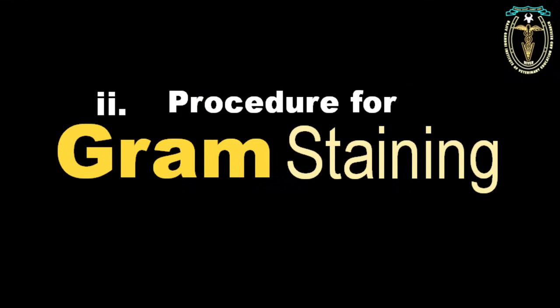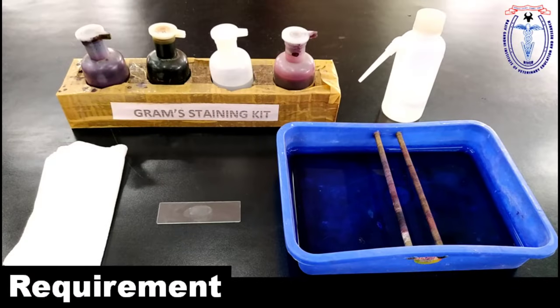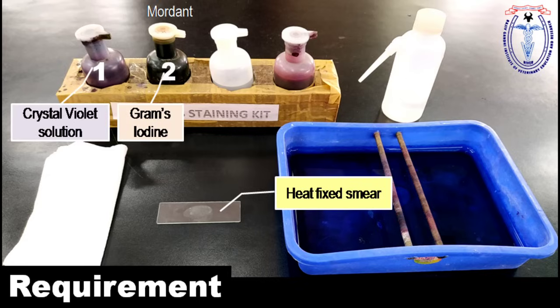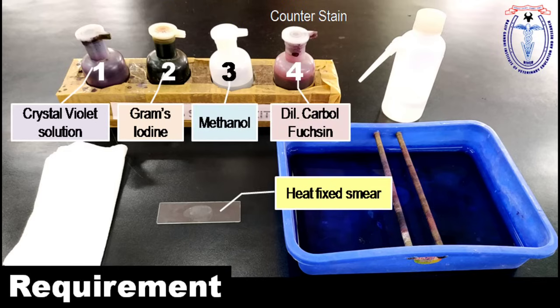Next, the procedure for the Gram staining technique. The materials required are the heat-fixed smear, the crystal violet staining solution used as a primary stain in this experiment, the Gram's iodine solution used as a mordant, the methanol used as a decolorizer, and the dilute carbol fuchsin staining solution used as a counterstain in this experiment. These are the four important solutions required for conducting the Gram staining technique.